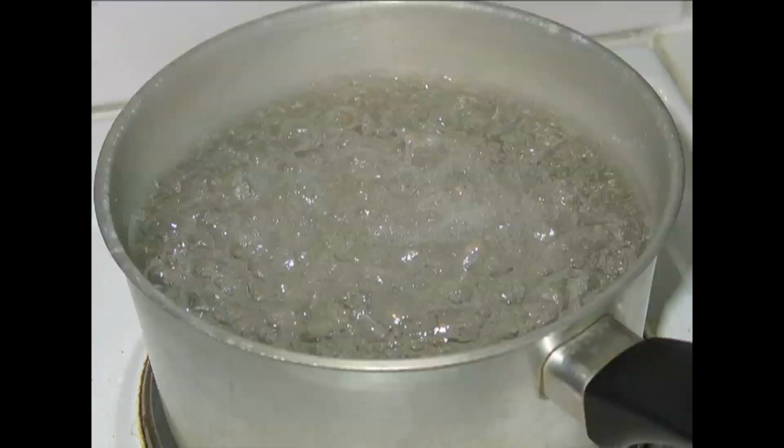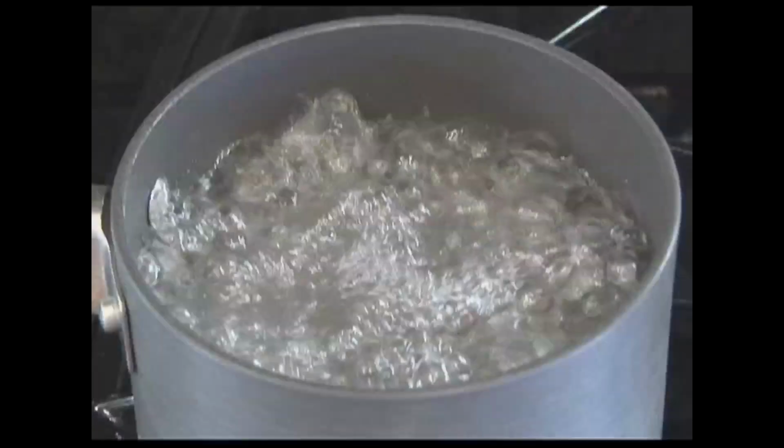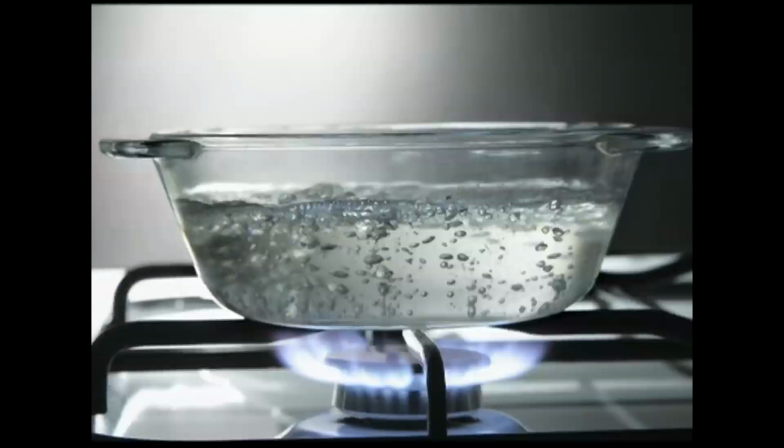It has been a method from ancient days that people know that anything we want to sterilize, if it is boiled in water, then it undergoes perfect sterilization. So 10 minutes of boiling is enough to kill the viable microorganisms. But this time is not sufficient to take care of the endospores, so we need to increase the duration up to 30 minutes.